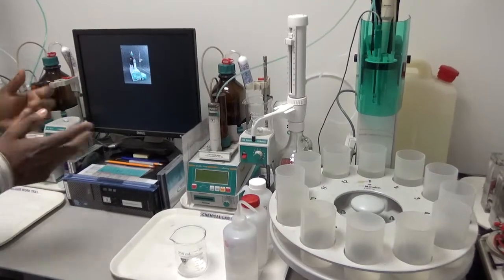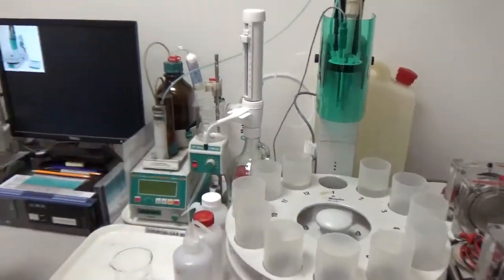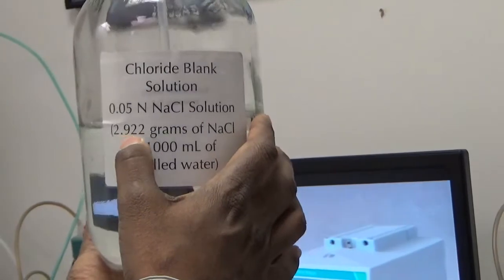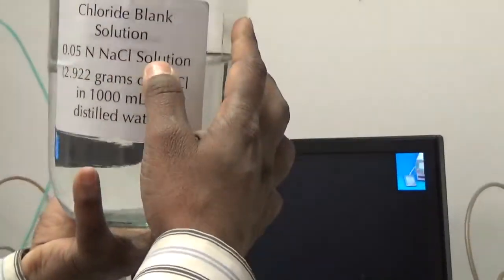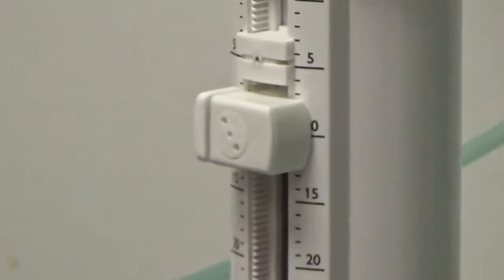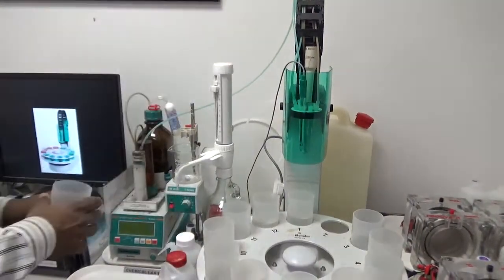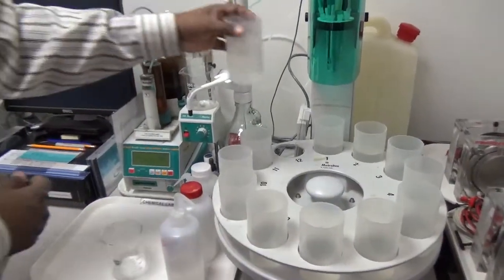Then we start running the unknown samples. For the blank solution, we take distilled water and add 5 milliliters of sodium chloride solution. The sodium chloride standard is 0.05 normal, prepared by adding 2.922 grams of sodium chloride in 1000 milliliters of distilled water. We add 5 milliliters of that 0.05 normal sodium chloride to both blank samples. Station 12 is just distilled water for cleaning the electrode.